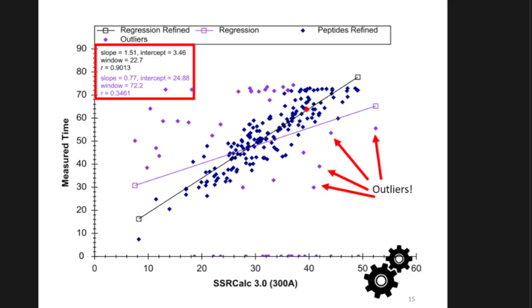A complex sample, yeah, as long as the peptides that you're targeting are measurable, I wouldn't expect to see the regression look any worse. It should be pretty well correlated. SSRCalc is strictly based on the amino acid sequence of the peptide, so it shouldn't be affected by the matrix. Another question in the back?